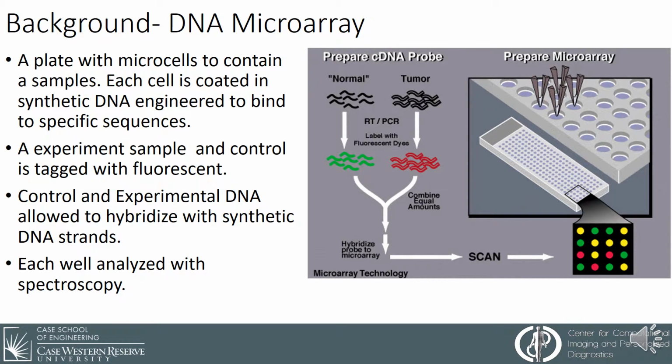Now, a DNA microarray is effectively a glass plate that has individual little cells, and on each little cell there is single-stranded synthetic DNA that has been specifically pre-designed to bind to DNA sequences on introduced samples.